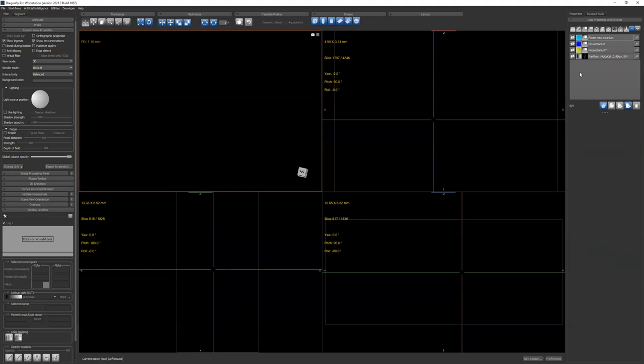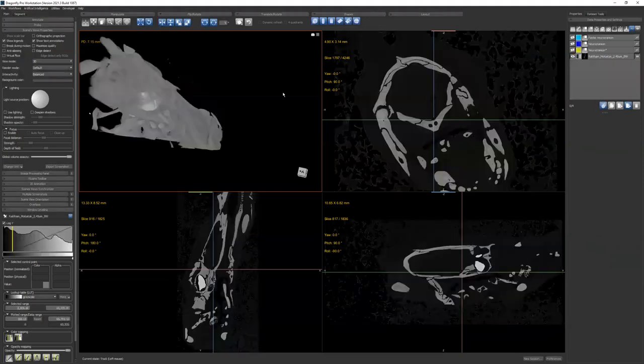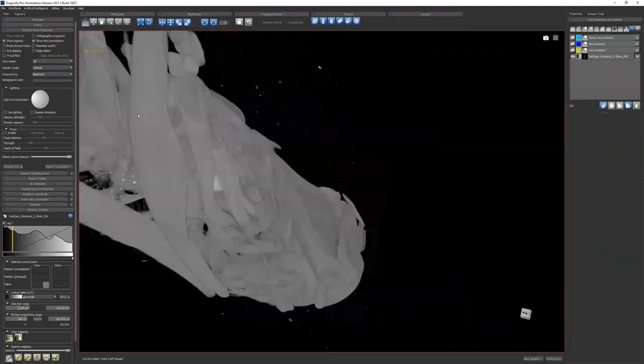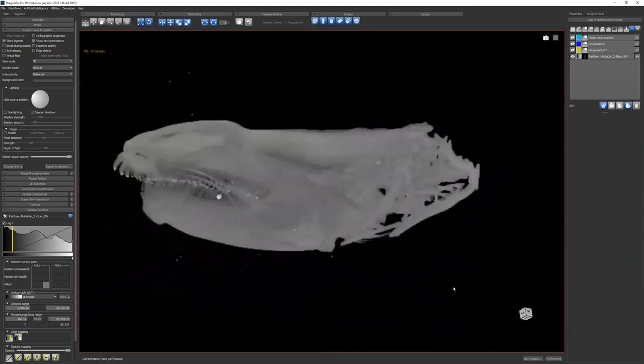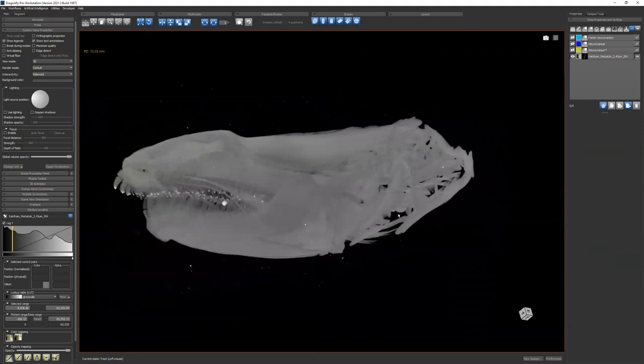What about taking images? Because that might be useful for you, I don't know. Yeah, think of a cross section or a theme, these growth lines, and then you can take an image. Okay. Along with taking images.